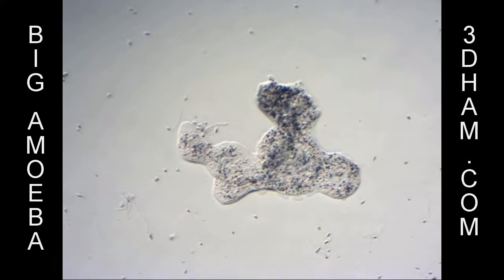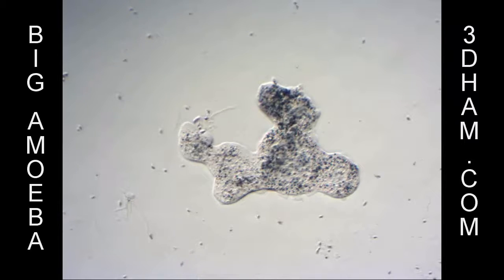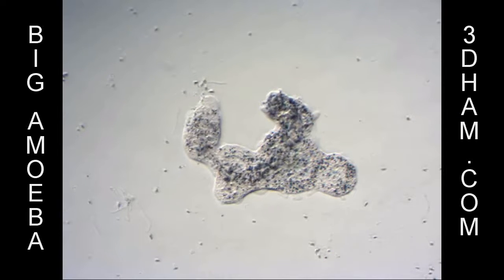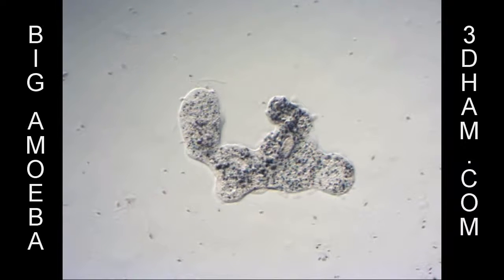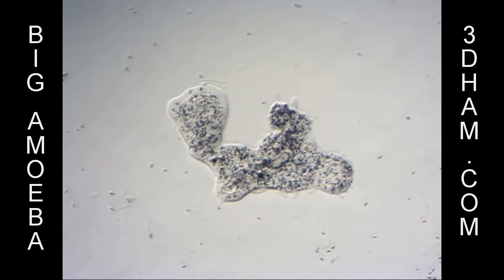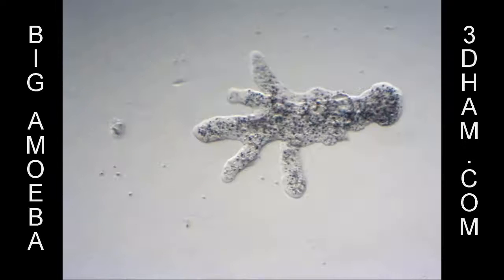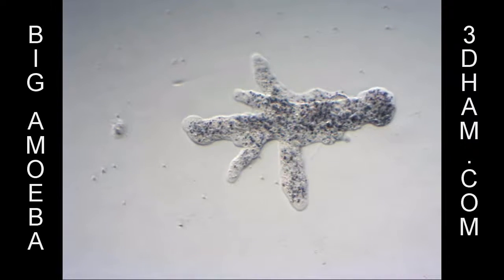Though they have a very primitive appearance, amoeba have all the characteristics that define eukaryotes, including mitochondria, a nucleus, and chromosomes. There are many different types of free-living amoeba. The kind most people think of are, like this one, so-called naked amoeba, but there are also testate amoeba that live in a kind of shell. In addition, there are many types of cells found in multicelled organisms that take on an amoeboid form, such as some white blood cells found in mammals, including humans.